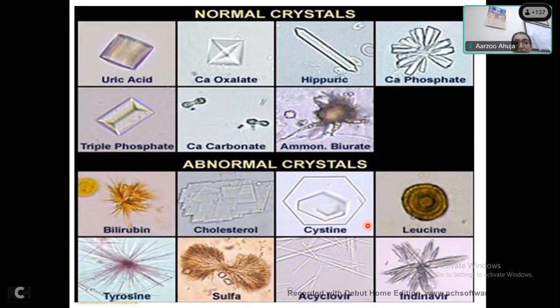This is just to summarize, give you an overview. You can have uric acid, oxalate. I didn't intently take up a lot of the uncommon ones, but the common ones mostly I have covered, right? And just to take this into account, sometimes you will see a urine which has a lot of these worm-like brown structures. So these are actually ammonium biurate crystals. You should remember that these are not contamination or anything. These are ammonium biurate crystals, right?